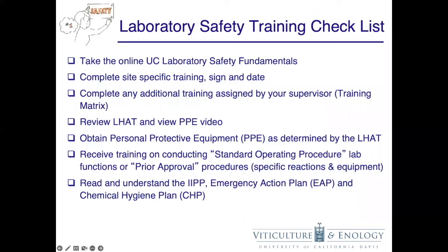Because working in the laboratory presents many various hazards, safety training must be completed prior to beginning any work in the lab. Personnel working in laboratories must complete the online UC Laboratory Safety Fundamentals, complete the site-specific training, and complete any additional training as required by the lab in which you will be working.